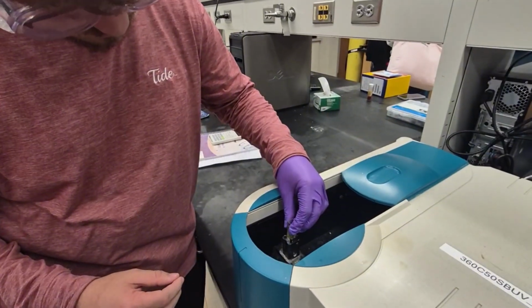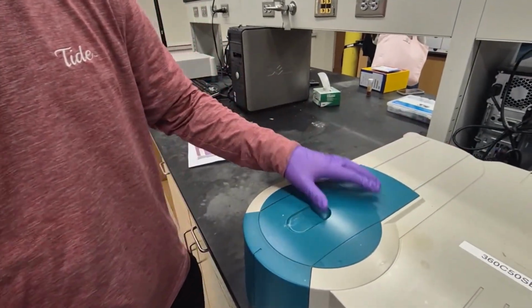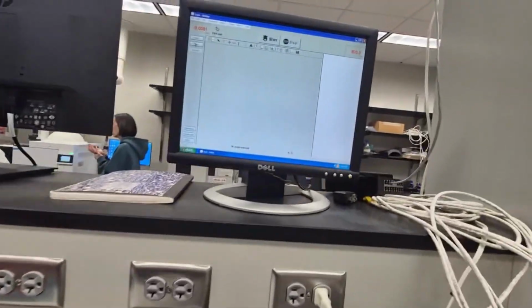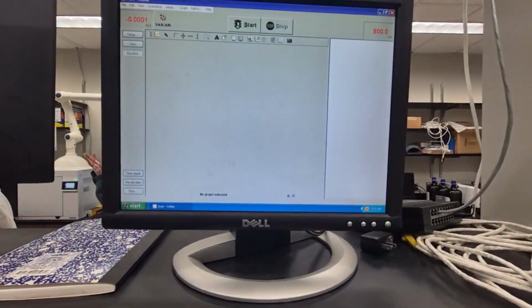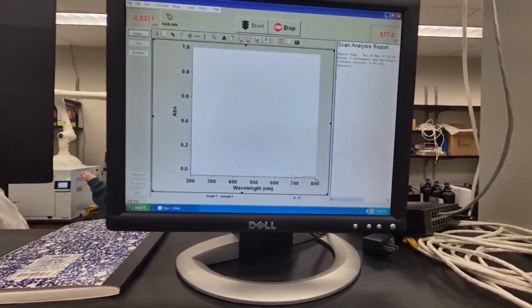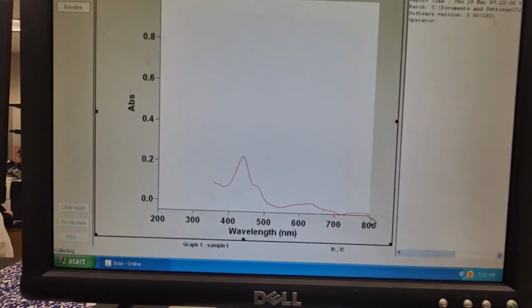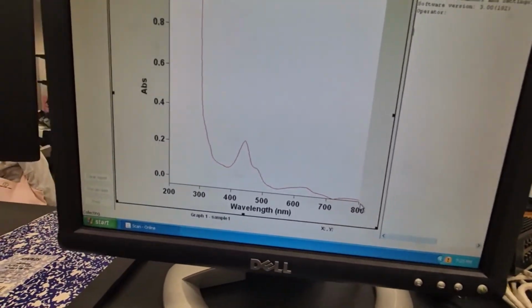Concentration is determined via preparing a series of standard solutions with known concentrations, and then performing a series of dilutions with the known concentration using the equation M1V1 equals M2V2. Quantitative data from a spectrophotometer is numerical, like absorbance values that can be used to calculate concentration, while qualitative data is more descriptive, like the color of the solution or which wavelengths are absorbed.